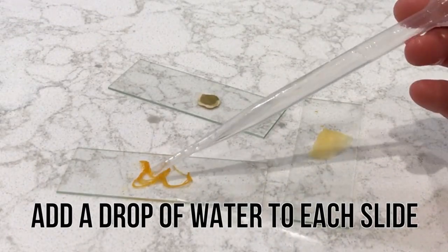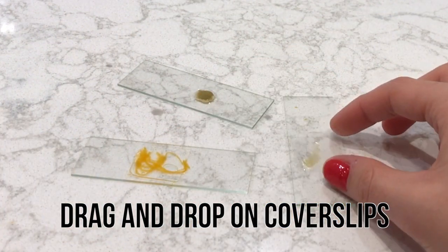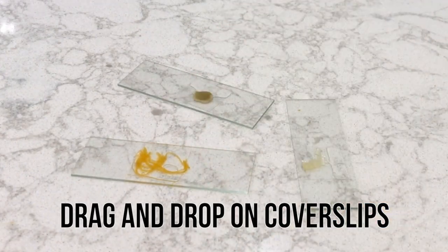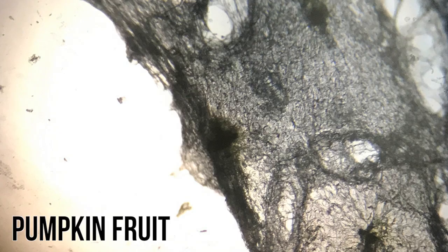Add a drop of water to each sample. Drag and drop cover slips on top of each slide. And ta-da! Your slides are done! Now it's time to check them out underneath the microscope.